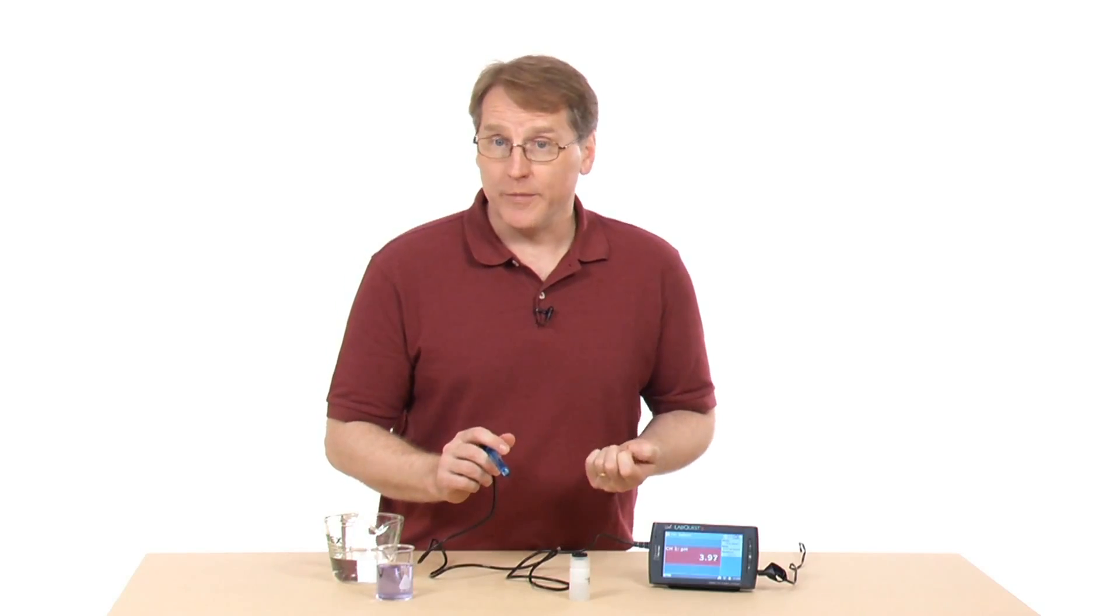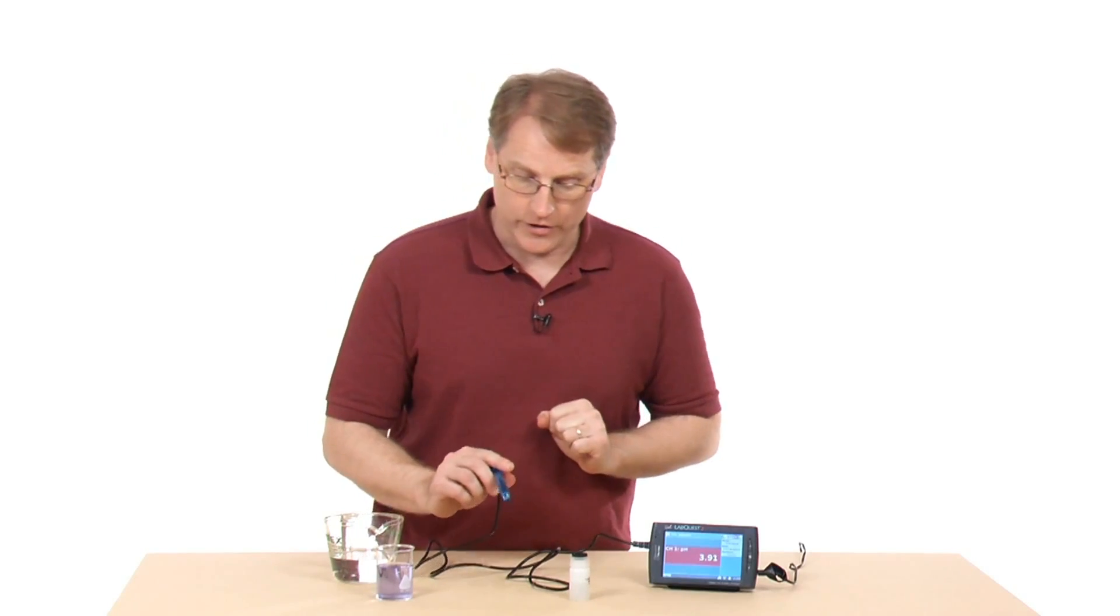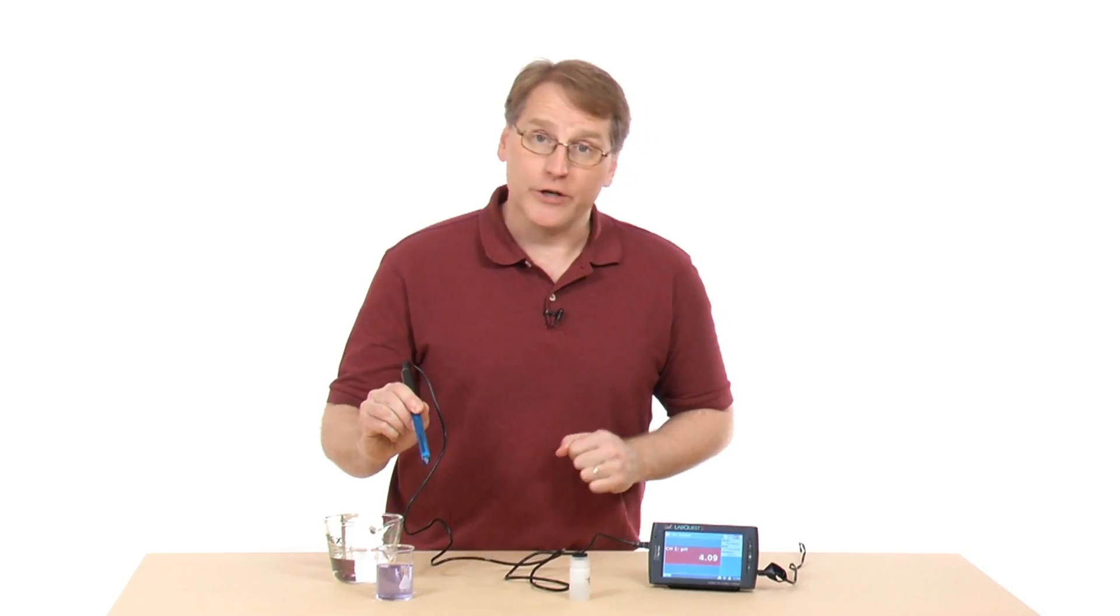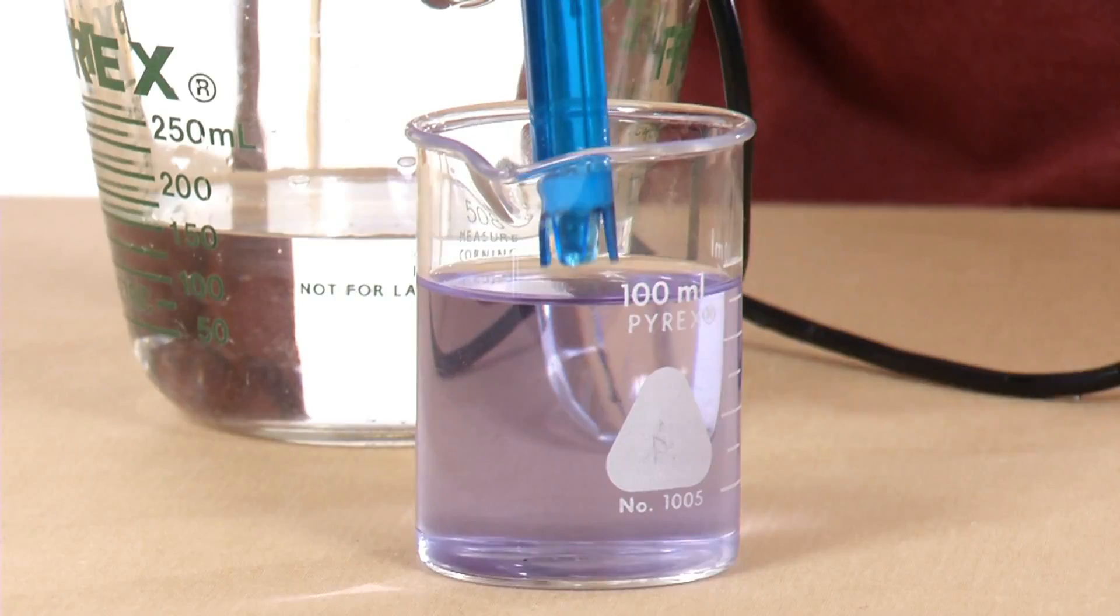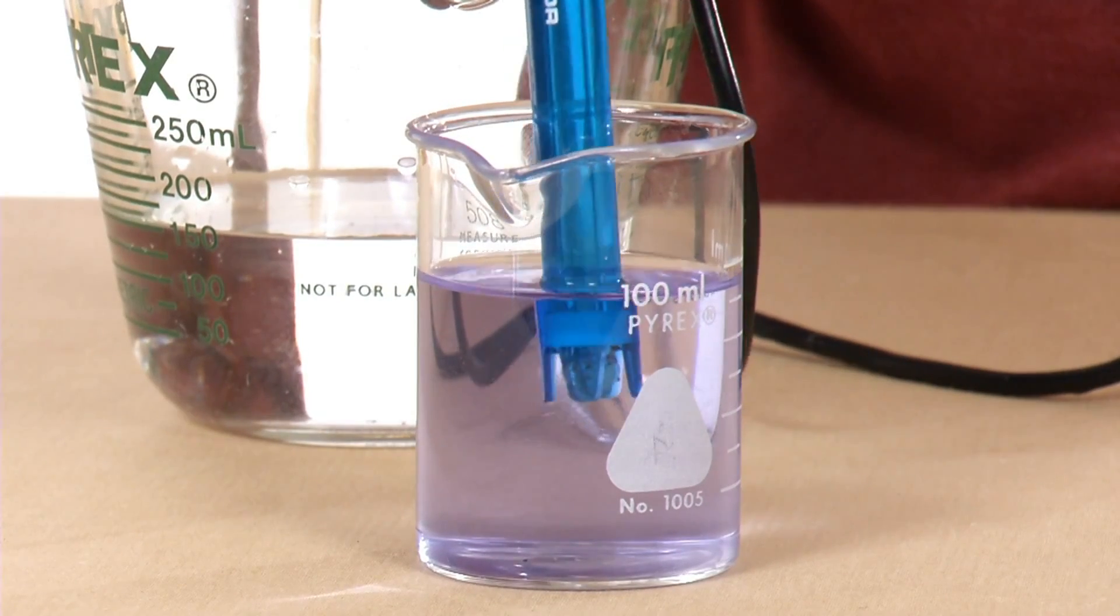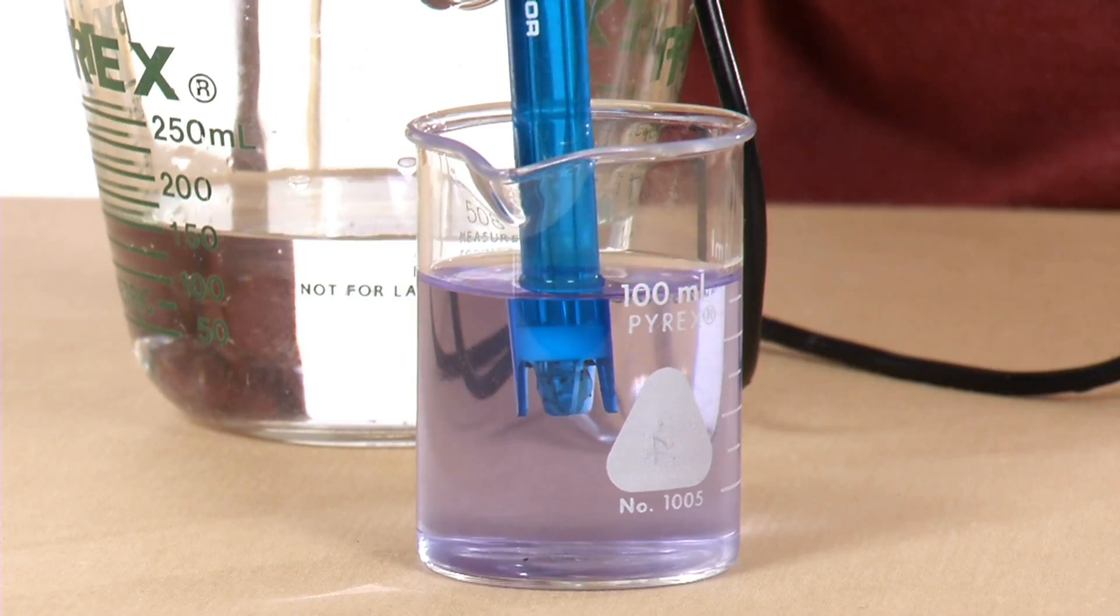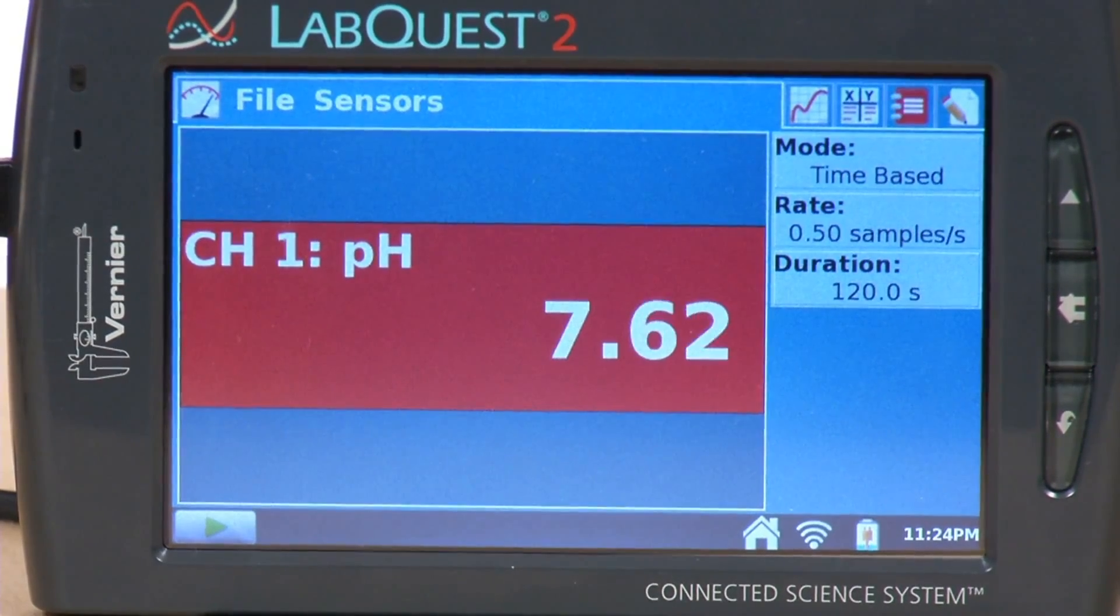Now I'm ready to make a measurement. I have a solution here, and we're interested to know what kind of solution that is. So I plunge it down in there, and we look at what happens to our meter value. It's climbing, so it must be a base.